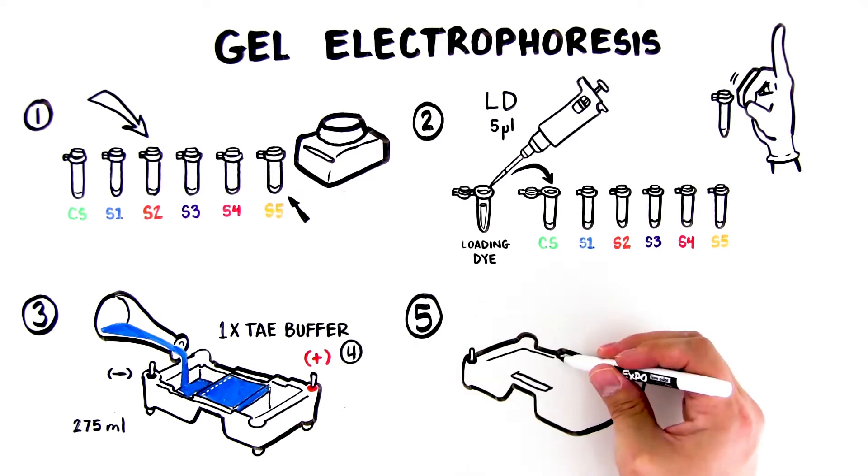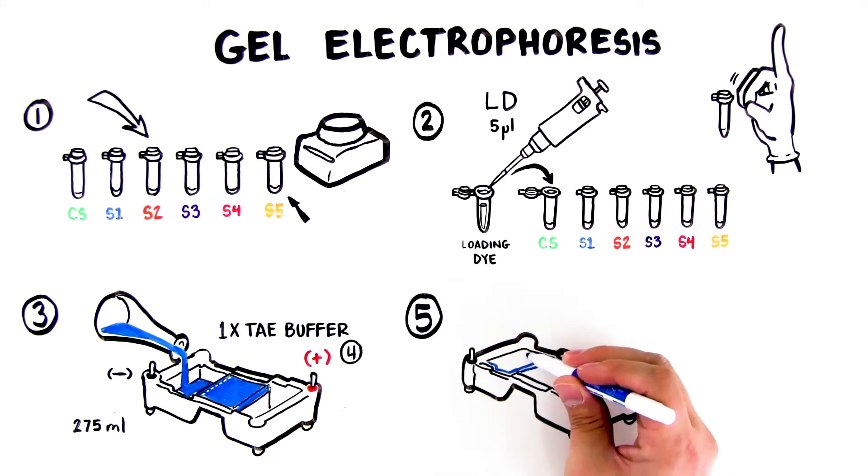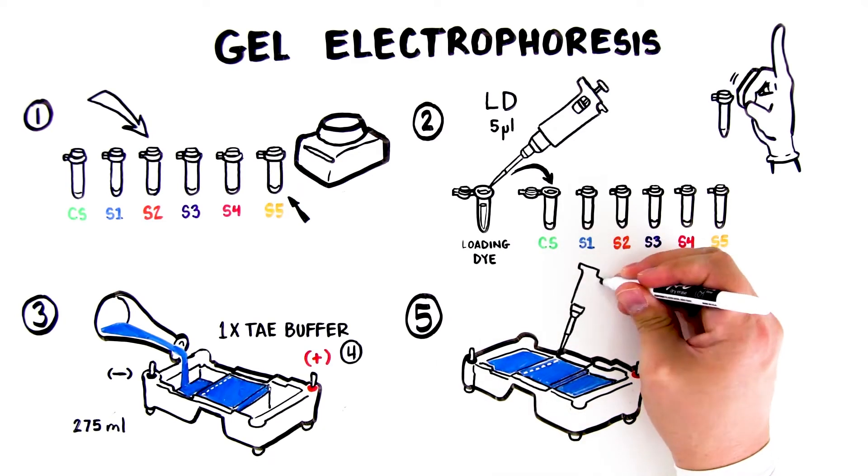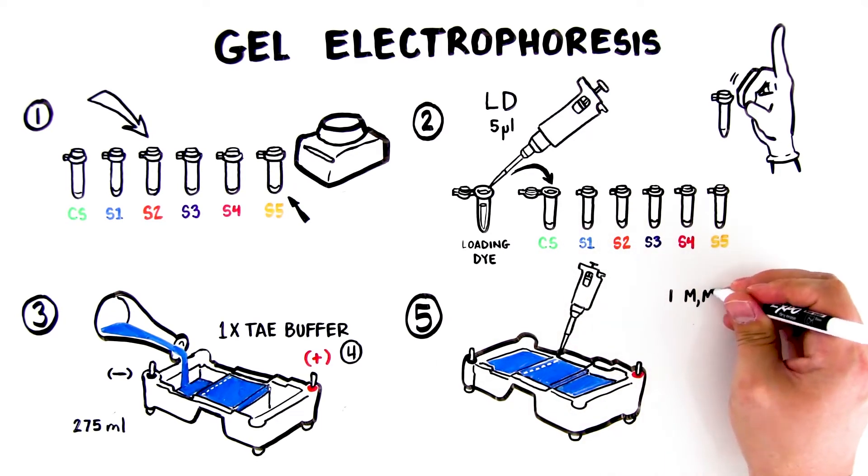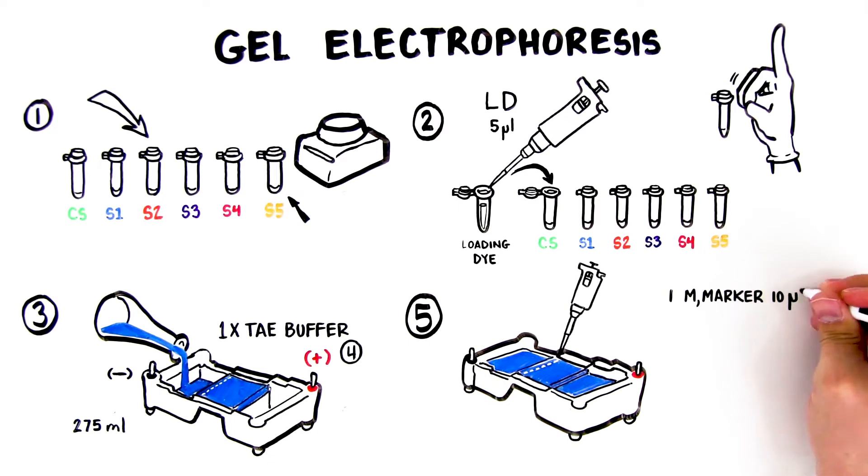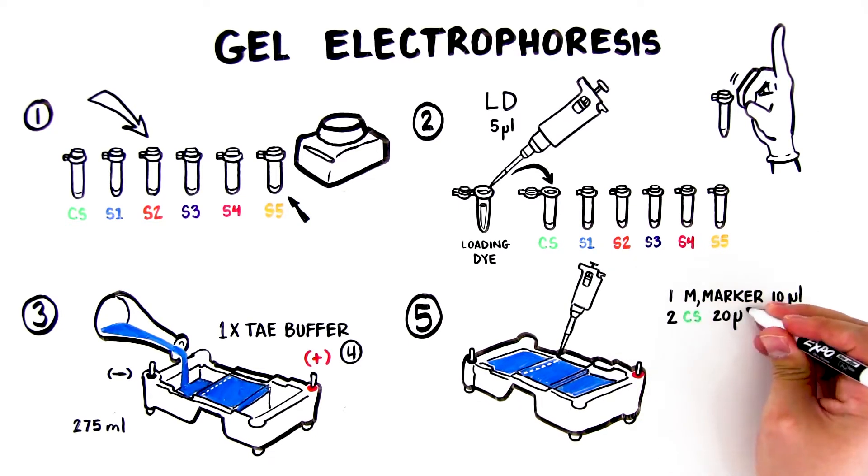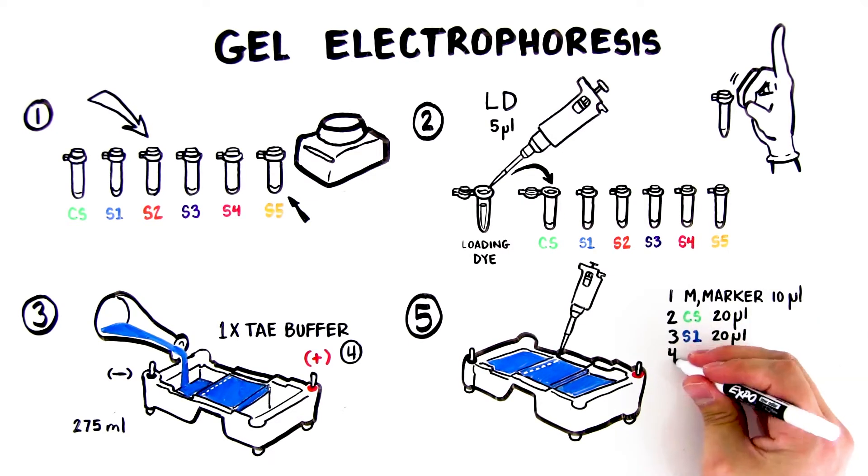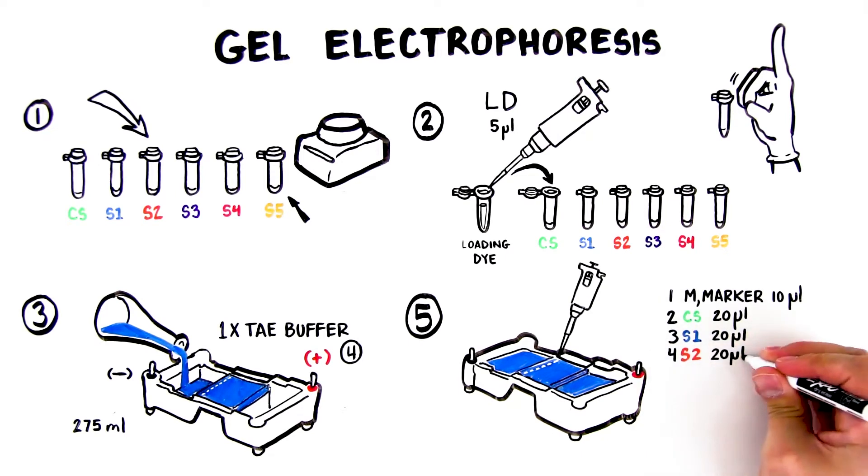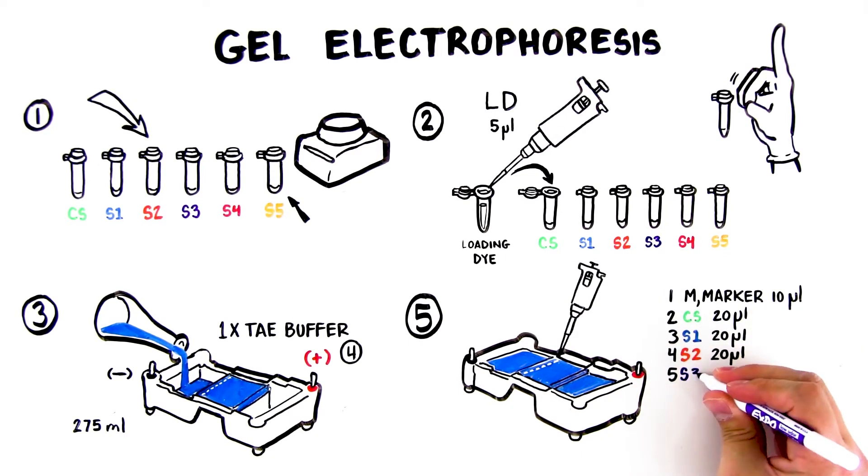Fifth, using a new tip for each sample, load the indicated volume of each sample into 7 wells of the gel in the following order. Lane 1: M, DNA size marker, 10 microliters. Lane 2: CS, Green, 20 microliters. Lane 3: S1, Blue, 20 microliters. Lane 4: S2, Orange, 20 microliters. Lane 5: S3, Violet, 20 microliters. Lane 6: S4, Red, 20 microliters. Lane 7: S5, Yellow, 20 microliters.